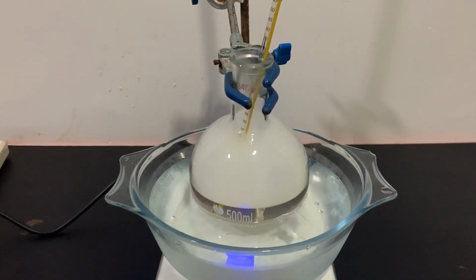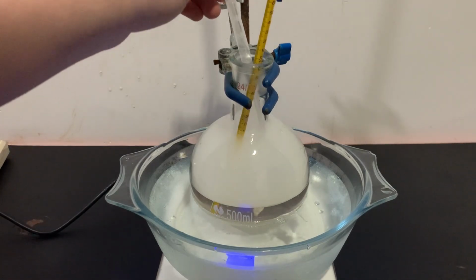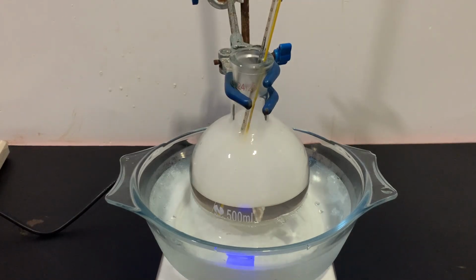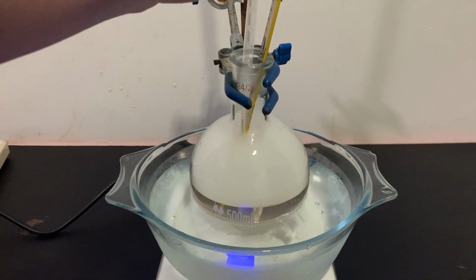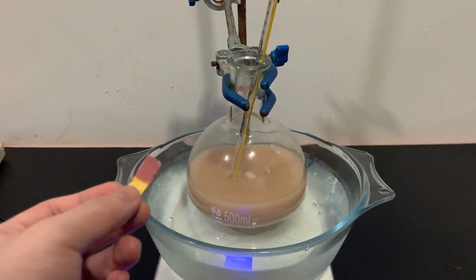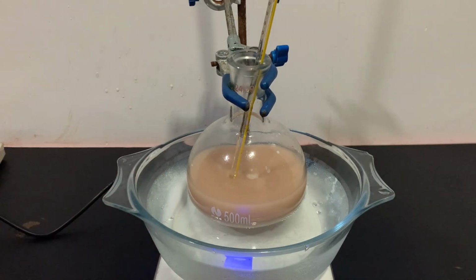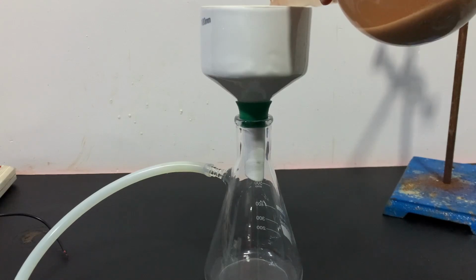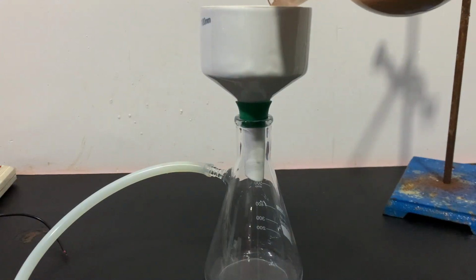I then started adding concentrated hydrochloric acid until the pH level of the solution is at 3. At a pH of 3, the anthranilic acid will precipitate out of the solution. Once the pH level is at 3, all of the anthranilic acid precipitated out. I vacuum filtered the solution to separate the anthranilic acid.